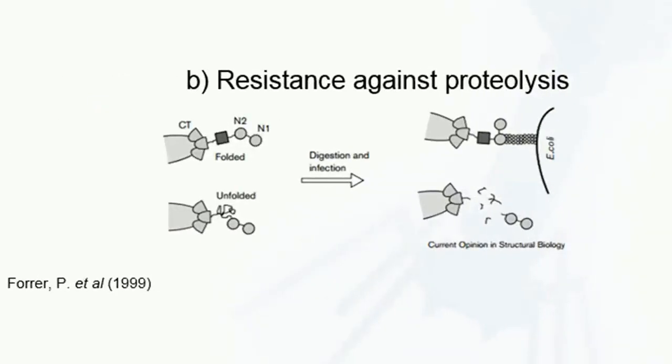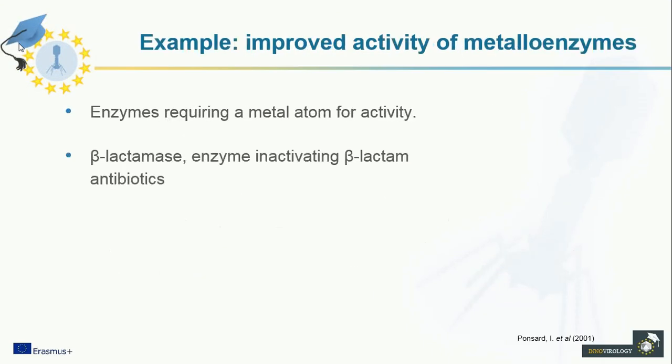Resistance against proteolysis can also be acquired through phage display. In this example, a library of mutagenized enzymes is expressed as a fusion protein with the enzyme of interest in the center of gene 3 protein. After digestion, only phages carrying a proteolysis-resistant enzyme have the N-terminal tail of G3 protein, which is required to interact with F pilus. Hence, only these phages are amplified in the biopanning step. The DNA sequence obtained from these phages will again encode this resistant enzyme and can be used for production of the modified enzyme.